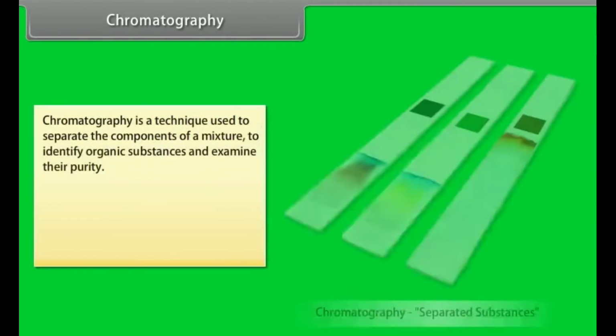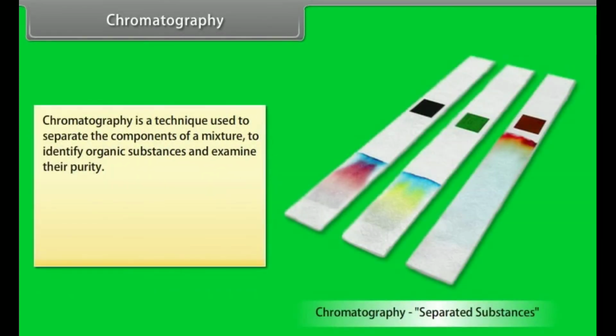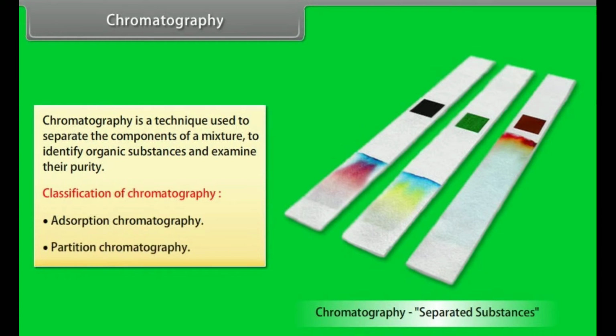Chromatography. Chromatography is a technique used to separate the components of a mixture to identify organic substances and examine their purity. Classification of chromatography: adsorption chromatography, partition chromatography.